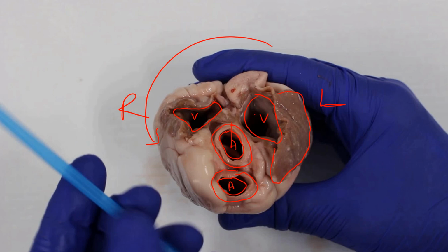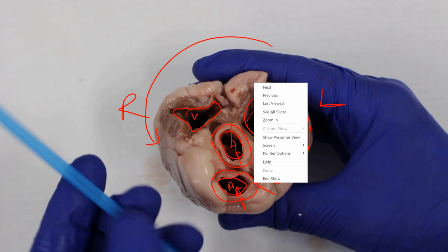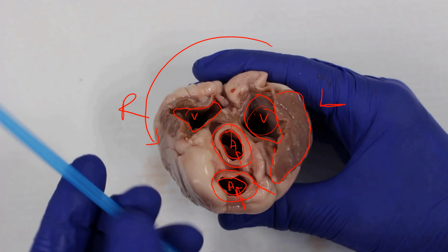to make the incisions, okay. So trying to figure out which is the left and the right side, okay, involves you taking your thumbs and imagine putting them down through these big, actually through the arteries here rather than through the veins, okay, putting them down through the arteries here and feeling the thickness of the wall. And I'm imagining that this wall, okay, should be much, much thicker than the other wall. The left artery, okay, is thicker, or has a thicker wall going down into the heart.